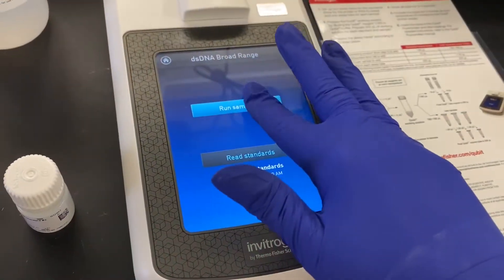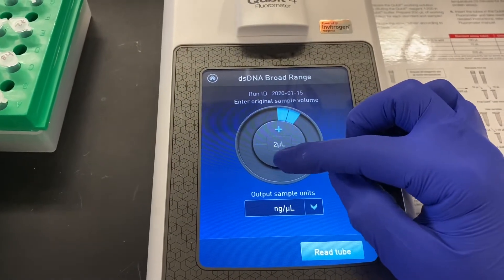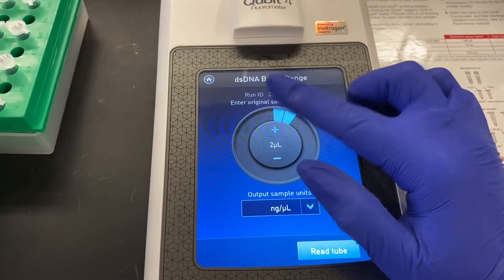There is an option to adjust the volume of the sample loaded, but you would also need to adjust the amount of working solution so that the total volume stays at 200 microliters.